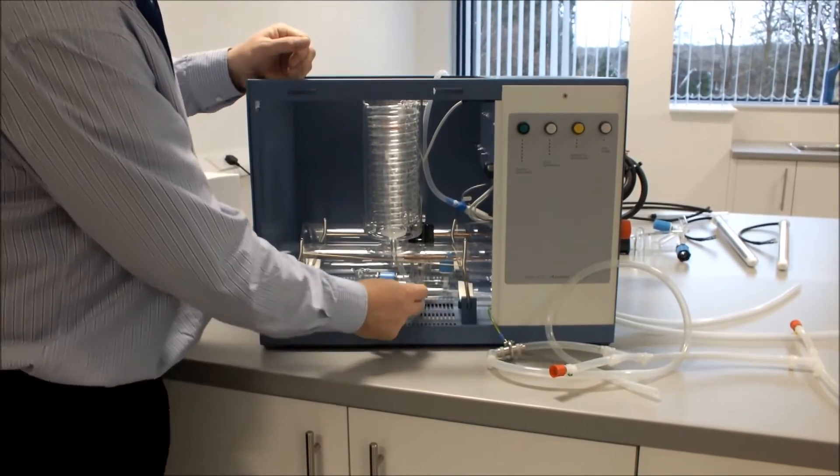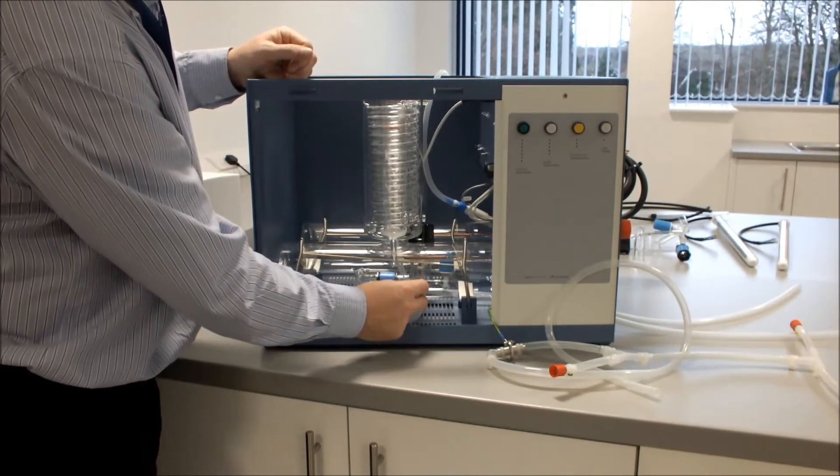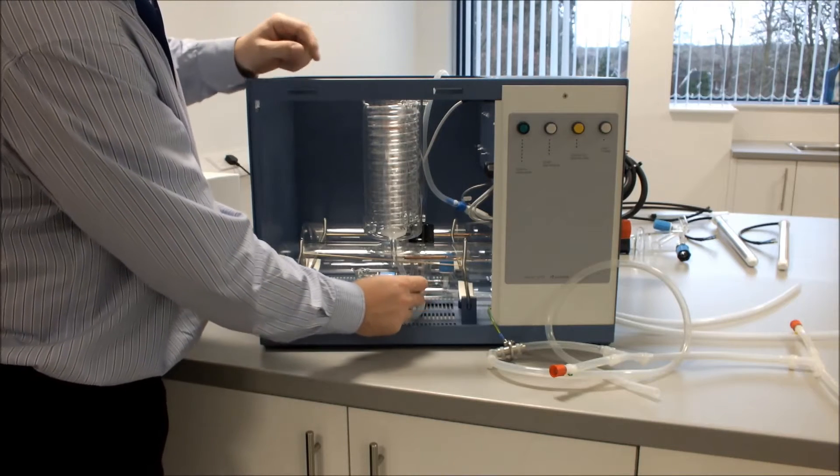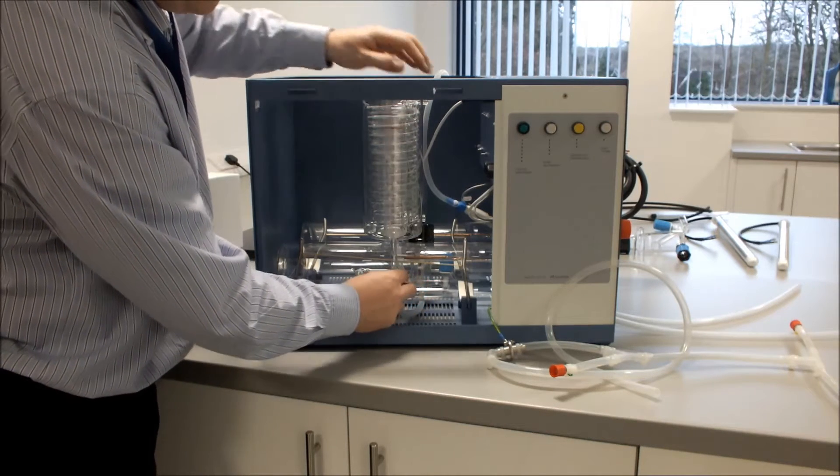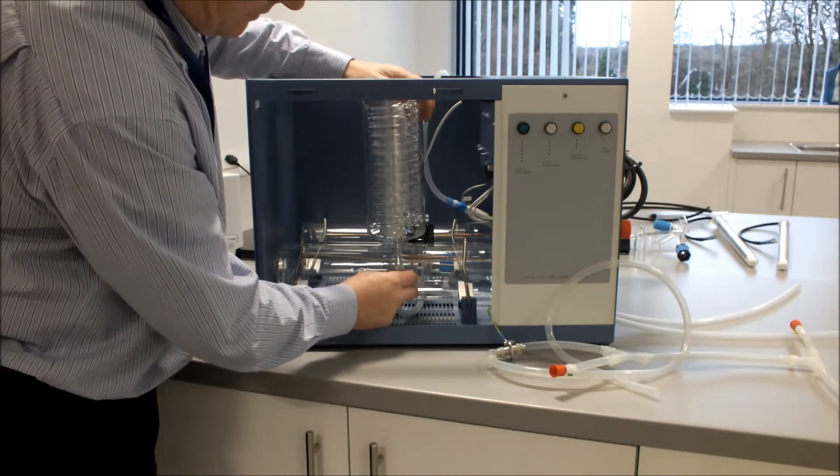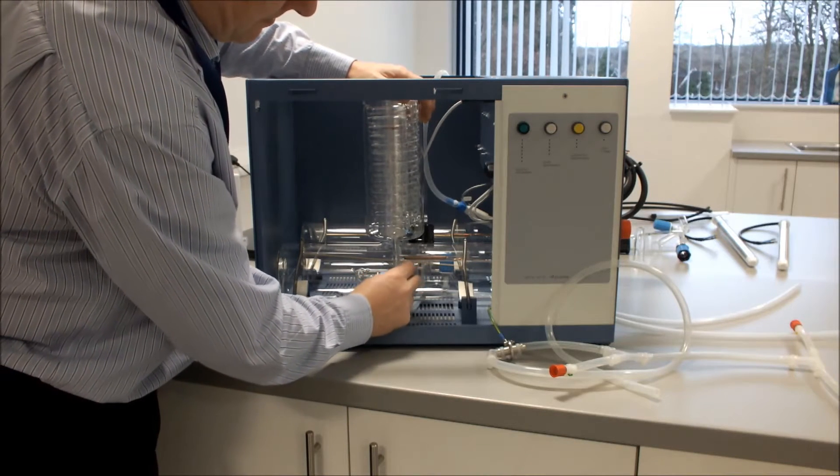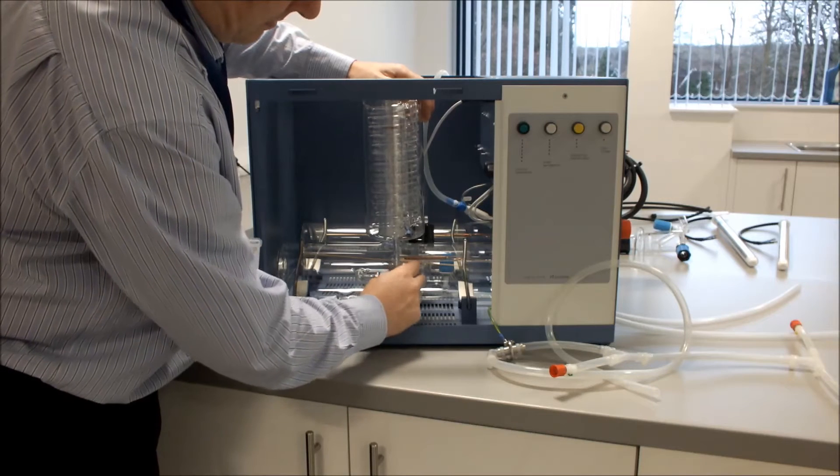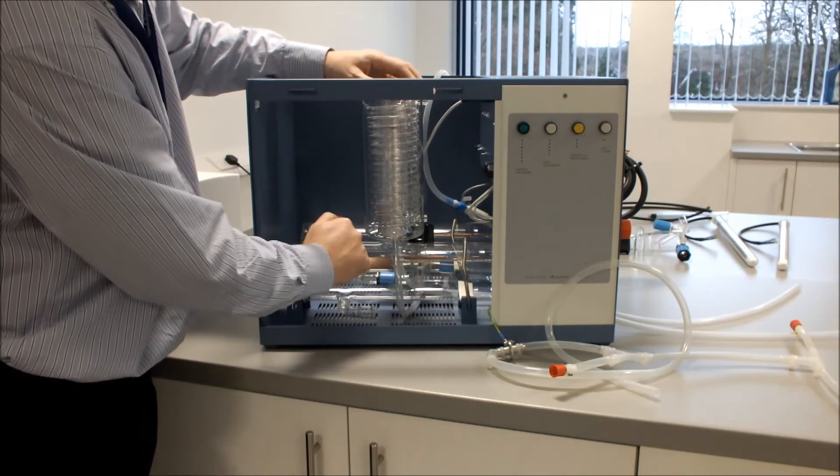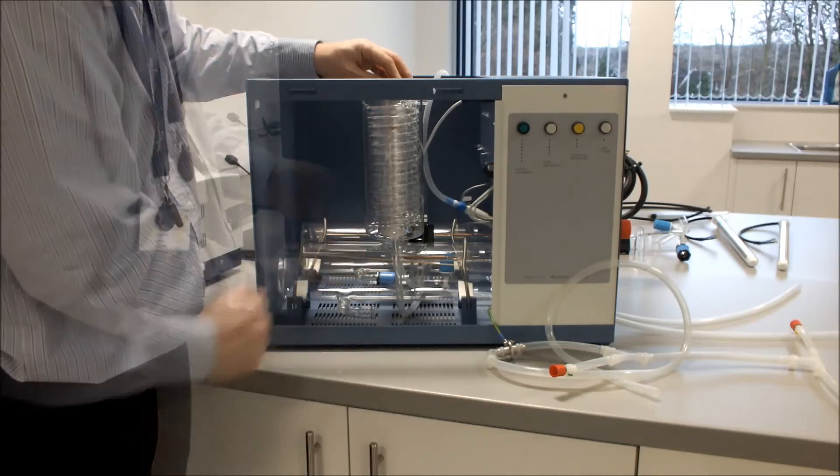We then connect our 300mm 8mm hose from our rear boiler control to the outlet of our condenser. Again this will be tie wrapped.